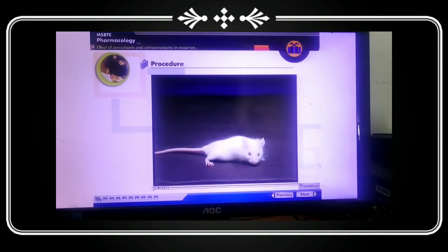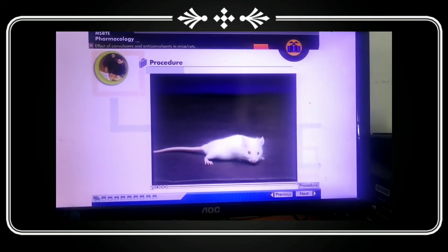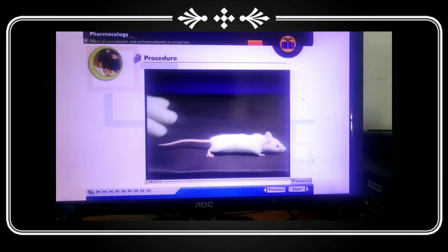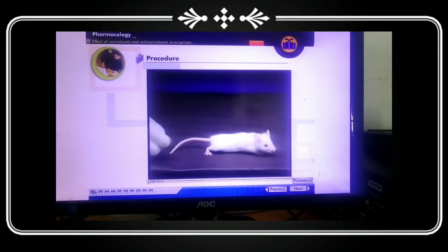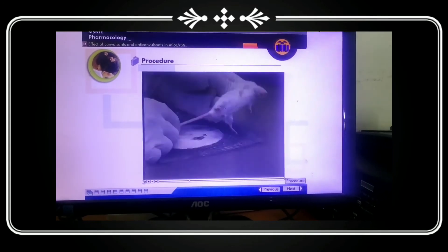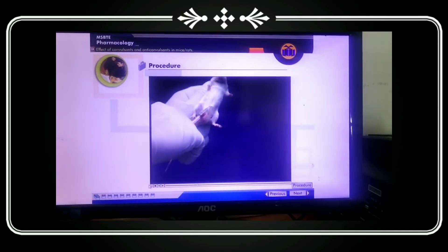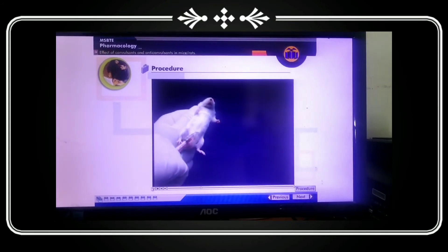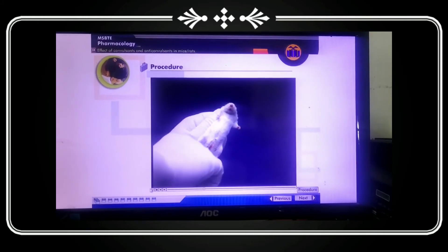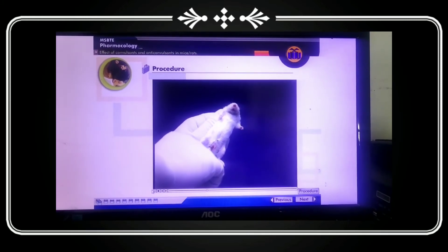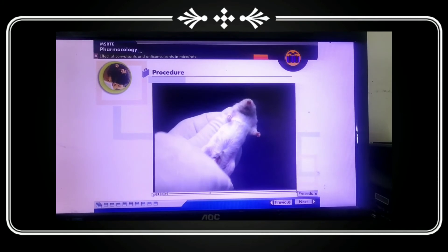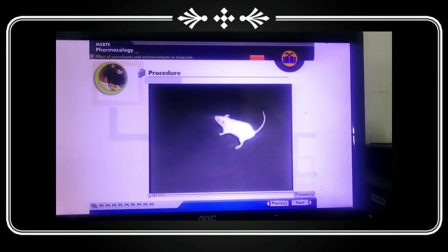You can see that we are monitoring the mice. We are taking the mice and will produce convulsions in them. We will administer strychnine to produce the convulsion in these mice. After giving the strychnine, we will observe the convulsions produced in the animal.